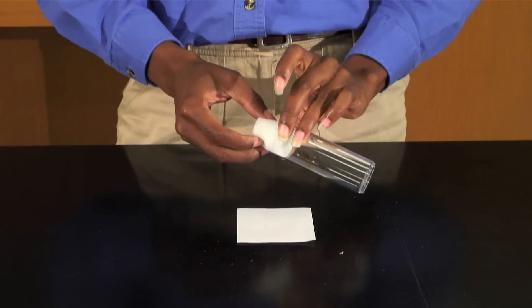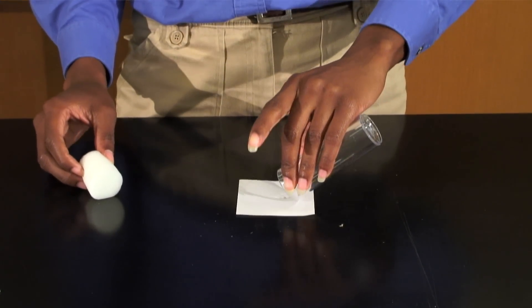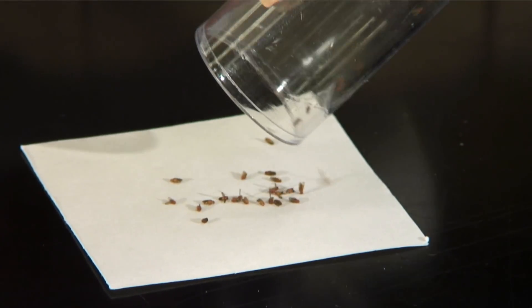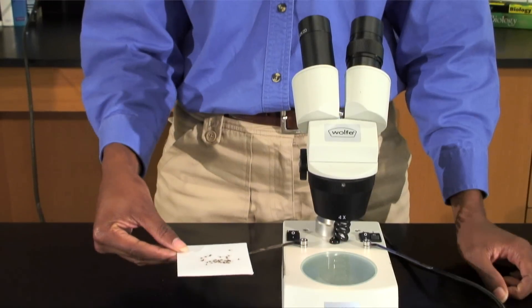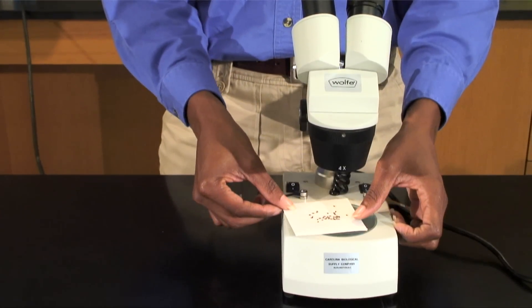Remove the plug from the vial of sleeping flies and tap them onto the sorting card. Place the sorting card on the stage of the stereoscope with the power as low as it can be.